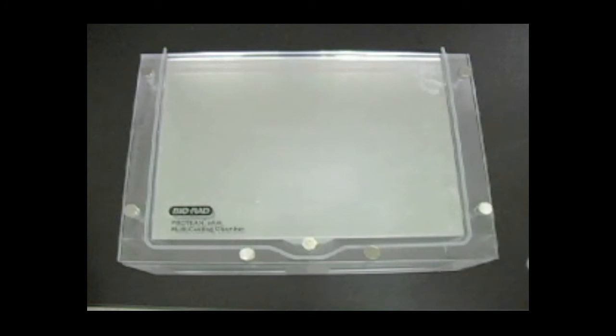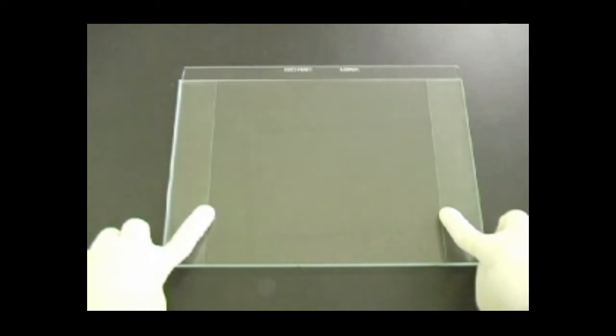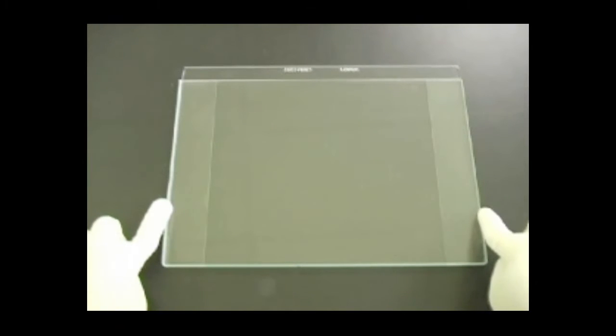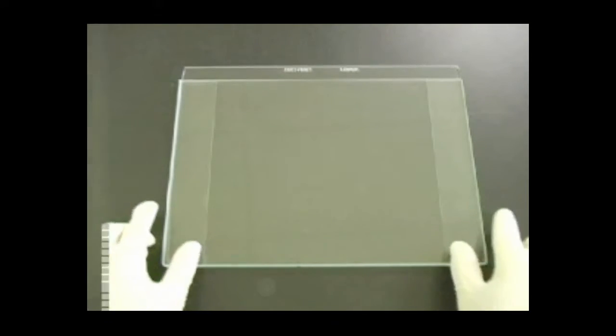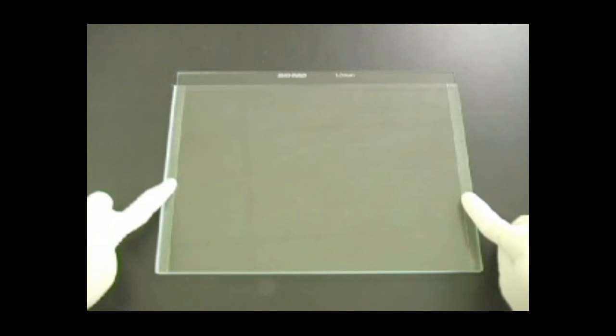Assemble the Protean Plus multicasting chamber with the desired amount of Protean Plus hinged spacer plates in the desired gel thickness and width. Protean Plus hinged spacer plates have two widths: 20 cm wide to fit either 17 and 18 cm IPG strips, or 25 cm wide to fit 24 cm IPG strips, as well as three different gel thicknesses of 1, 1.5, and 2 mm.